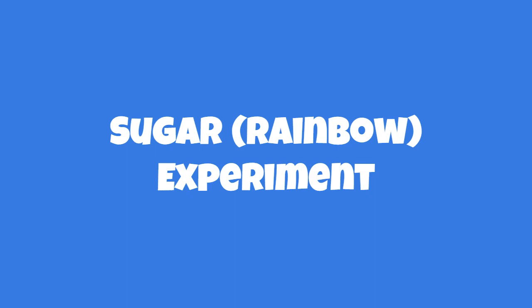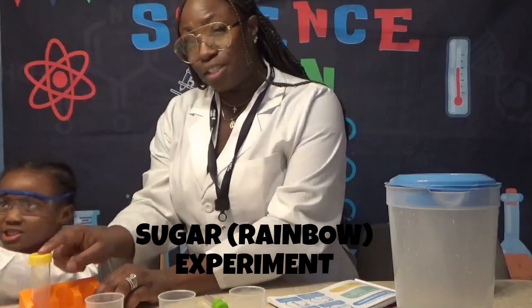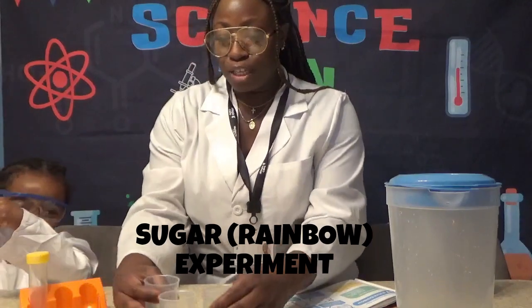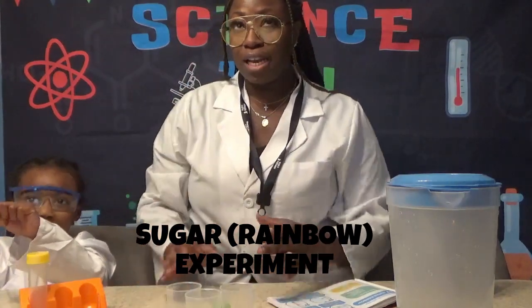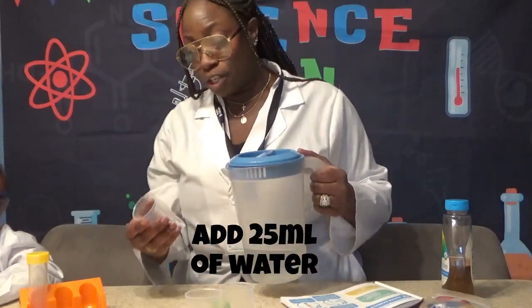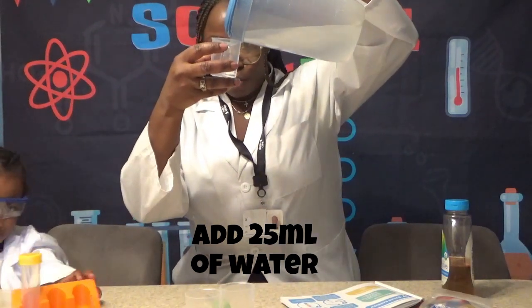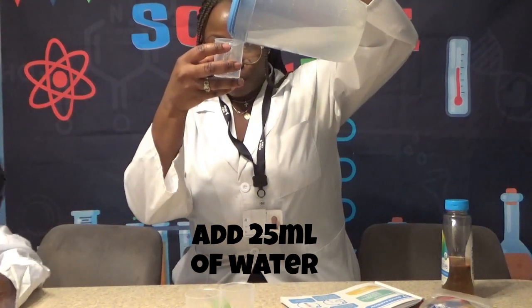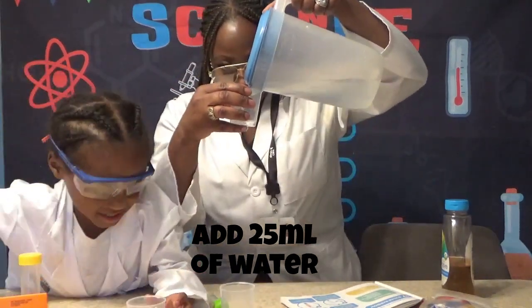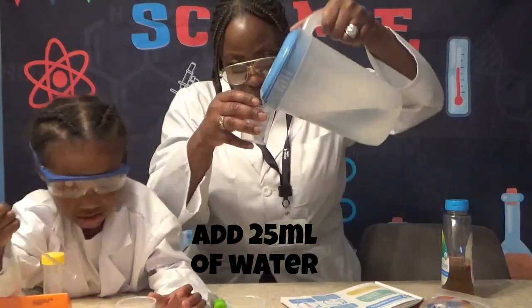We are going to be doing the sugar rainbow experiment. We have a test tube, a stir stick, and three beakers that we're going to use to help us measure the water perfectly. We have to fill each one up with 25 milliliters — these are 100 milliliter beakers — so we're going to put 25 here, 25 here, and 25 here.